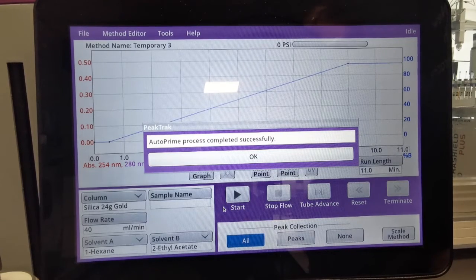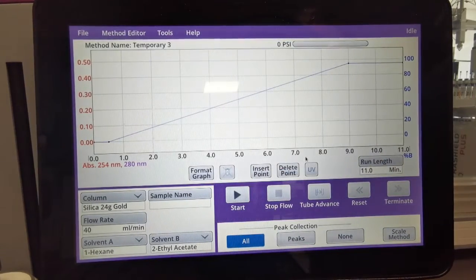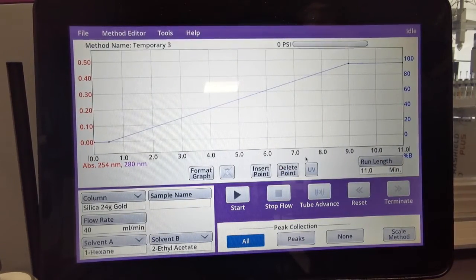Once the Auto Priming has been completed, it will give you this message to let you know. Simply press OK. We're then ready to reprime the pumps and the solvent lines with the solvent of choice.